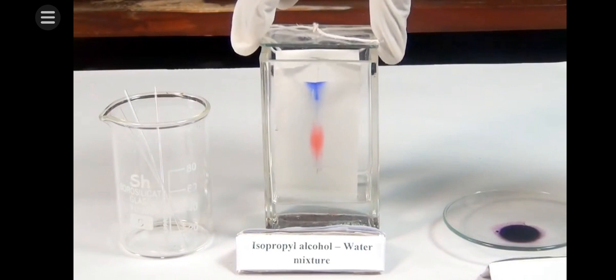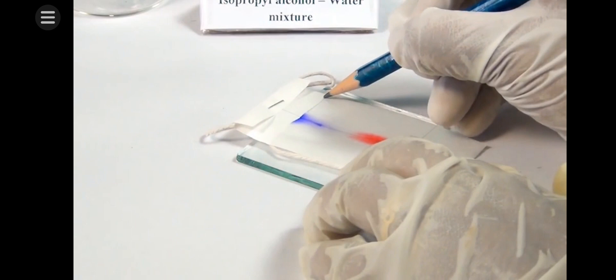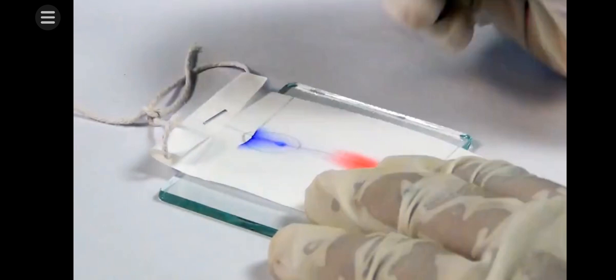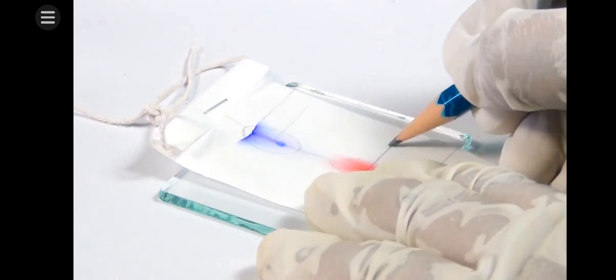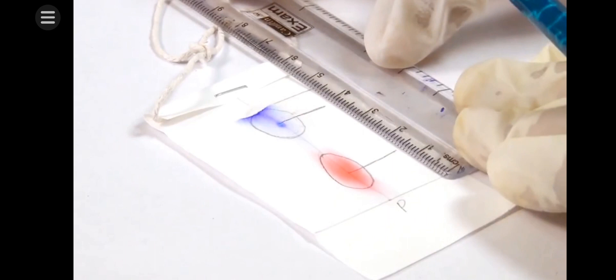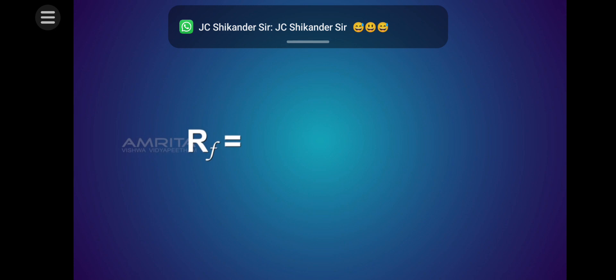Take the filter paper out of the chamber and mark the distance that the solvent has risen on the paper with a pencil. This is called the solvent front. Dry the filter paper and put pencil marks on the centre of the red and blue ink spots. Measure the distance of the two spots from the original line and the solvent from the original line.